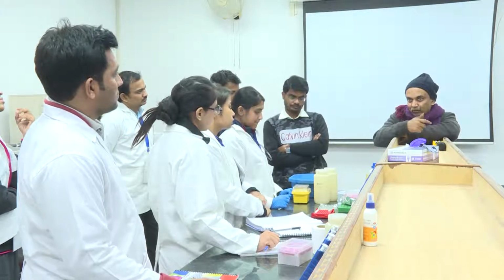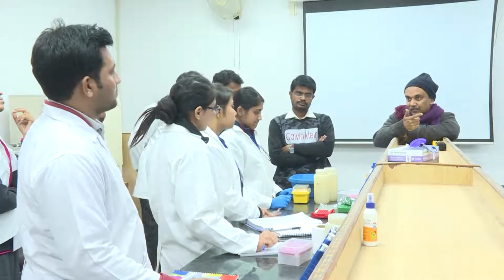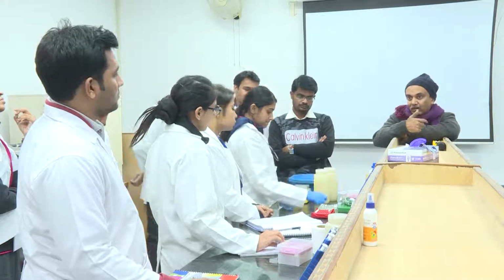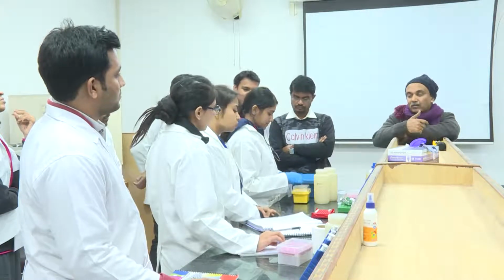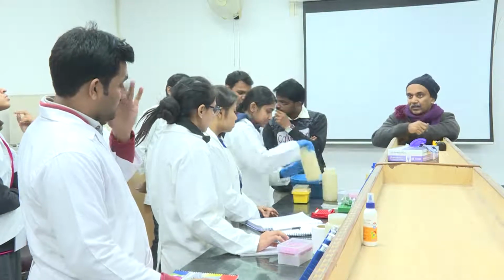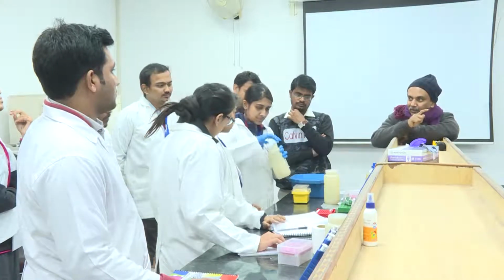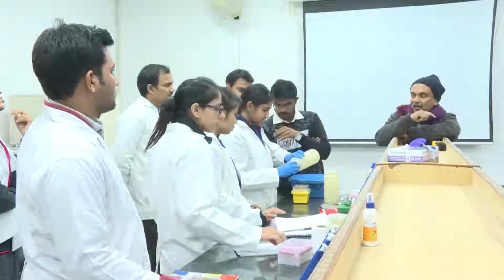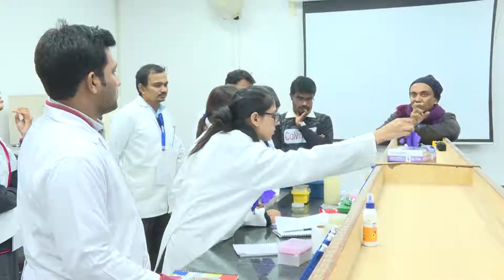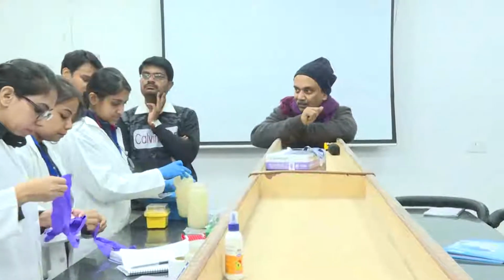So that's one of the reasons we wanted to move on to genomic based molecular methods for several investigations. If you go for culture based methods, you are going to wait a long period to quantify them, and some of the methods like MPN counting are also being done in several laboratories. In fact, if you leave your MPN tubes for a longer period, all of them will give the same numbers. They will reach the maximum number which you can estimate with an MPN tube. So we have certain difficulties with the culture based methods. Those can be overcome using molecular methods.